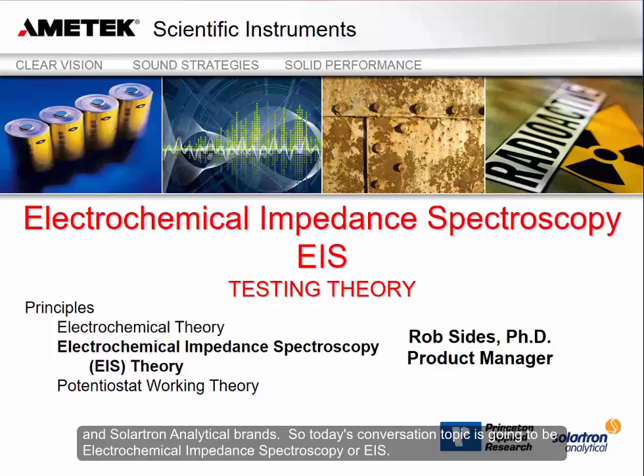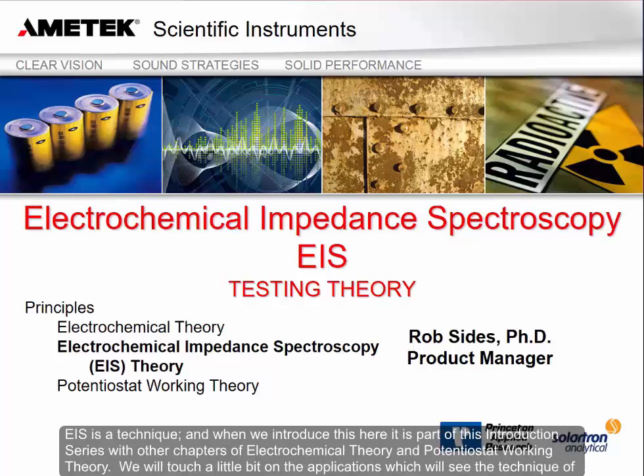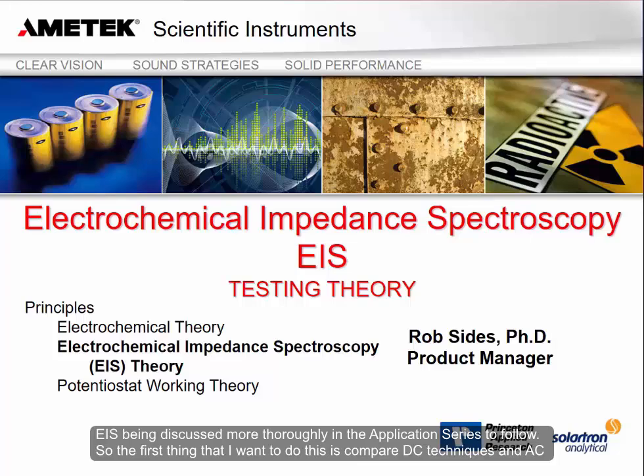So today's conversation topic is going to be on Electrochemical Impedance Spectroscopy, or EIS. EIS is a technique, and we're going to introduce this here as part of this introduction series with other chapters of electrochemical theory and potentiostat working theory. We'll touch a little bit on the applications, but you'll see the technique of EIS being discussed more thoroughly in the application series to follow.